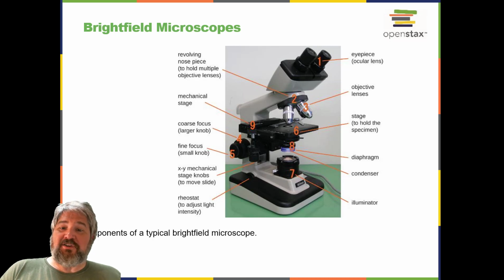Further magnification would create a larger image, but without increased resolution. This allows us to see objects as small as bacteria, which are visible at about 400x or so, but not smaller objects such as viruses. At very high magnifications, resolution may be compromised when light passes through the small amount of air between the specimen and the lens. This is due to the large difference between the refractive indices of air and glass. The air scatters the light rays before they can be focused by the lens.